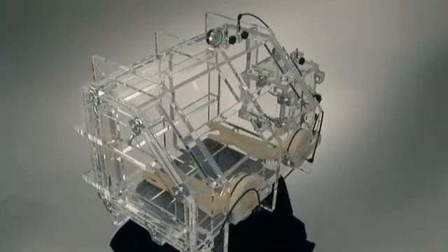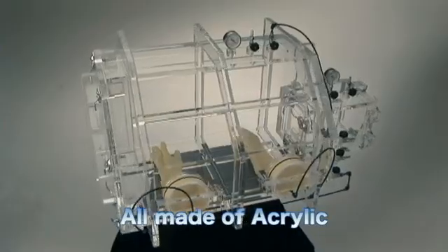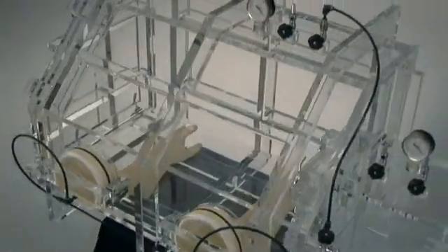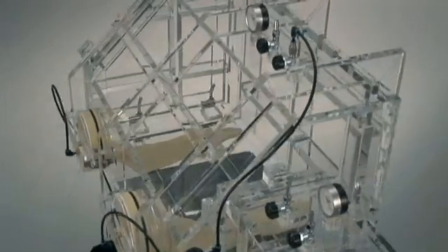This vacuum glovebox is made of acrylic. Compared with metal, it is much more clear, affordable, and suitable for experimental observation.